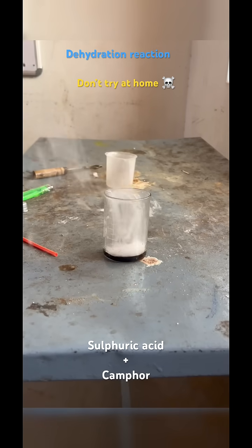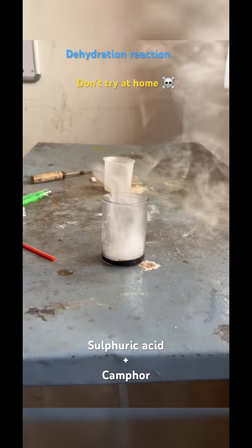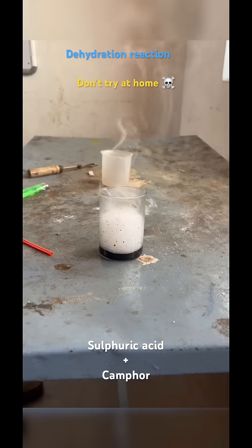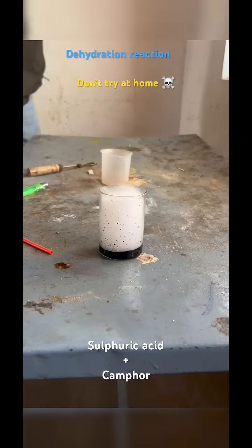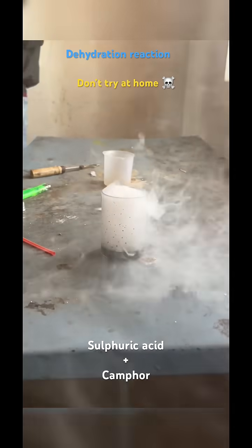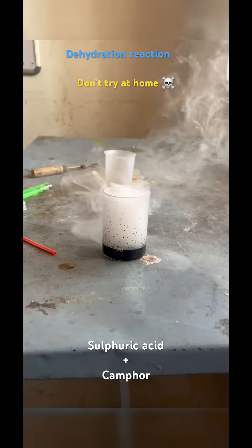You can see how dense fumes are coming. These dense fumes include sulfur dioxide along with other organic matter. This is giving a pungent odor and is very dangerous. We always have to perform this reaction under a fume hood and take proper precautions, because concentrated sulfuric acid is corrosive in nature.